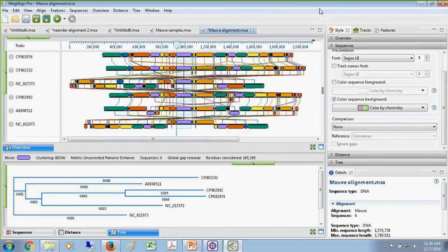And the first one is, what is the algorithm behind building the phylogenetic tree? Is there any way to tell what algorithm was used? Oh, yes. So the algorithm that's automatically, oh, sorry, microphone. So yes, the algorithm behind the phylogenetic tree is neighbor joining. And there's a little indicator right here. I don't know if it's the clearest. It says BioNJ. The NJ is neighbor joining.